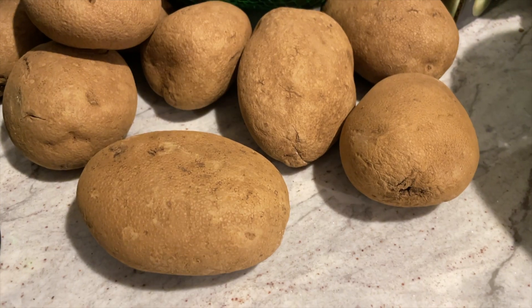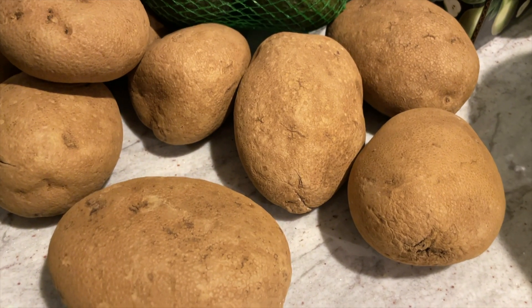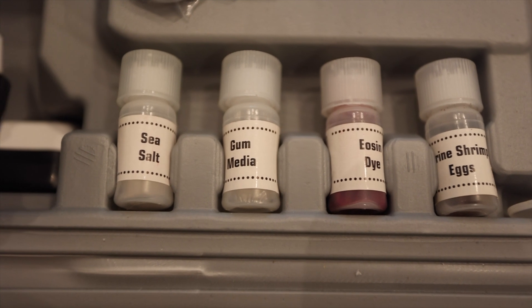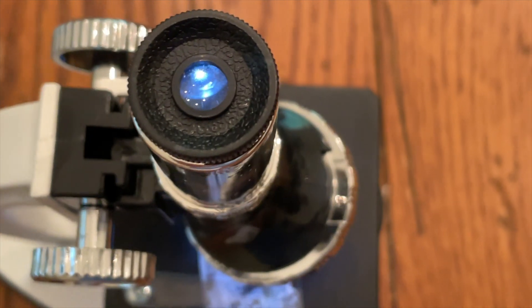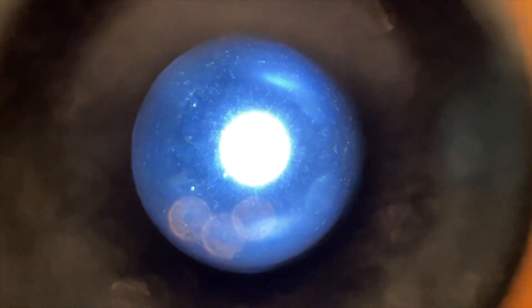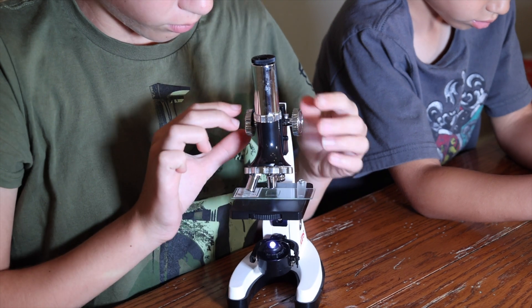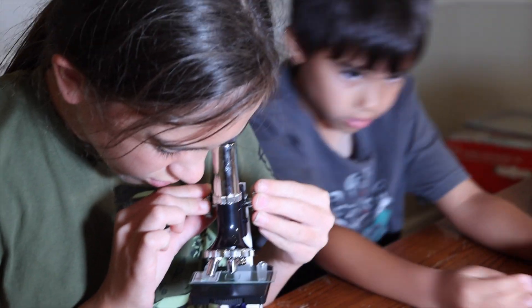Another example in the instructions is making a slide of a household potato: take a thin slice, place it on the slide, stain it with eosin dye (which is fortunately included in the kit), let it dry, place a cover slip on top, and then put it under the microscope. So it's a process that can take some time. If your kids have a short attention span, you may want to start cheap and see if they're really interested in microscopy before investing in a more expensive microscope — because every parent has heard the 'if you buy this for me I promise I will use it' speech. All that being said, the Carson Micro Mini is the clear winner in the usability category.